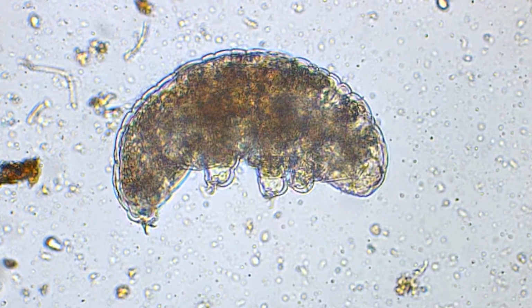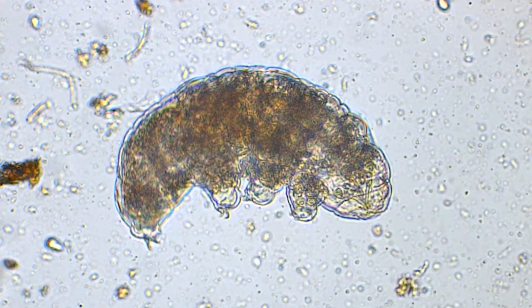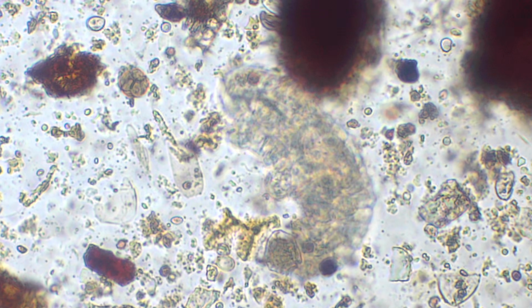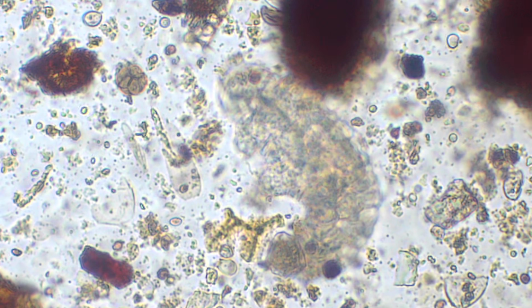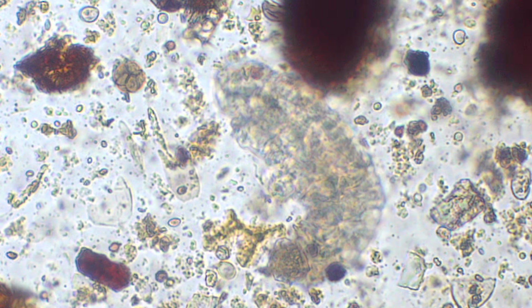Tardigrades. In forest samples, especially mosses, you may find tardigrades, also known as water bears or moss piglets. These eight-legged creatures are whimsical but mighty and known for their ability to withstand the vacuum conditions of space. They are indicative of aquatic environments and can be rare in soil and compost samples. Occasionally, we have seen tardigrades in compost samples, particularly ones that are higher in moisture. Tardigrades feed on algae, plant material, nematodes, and other smaller microbes.